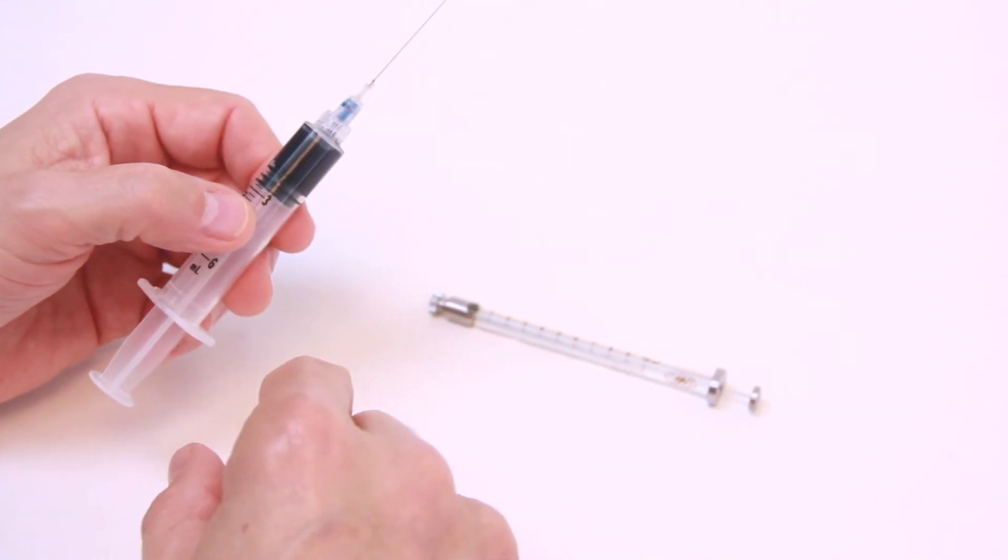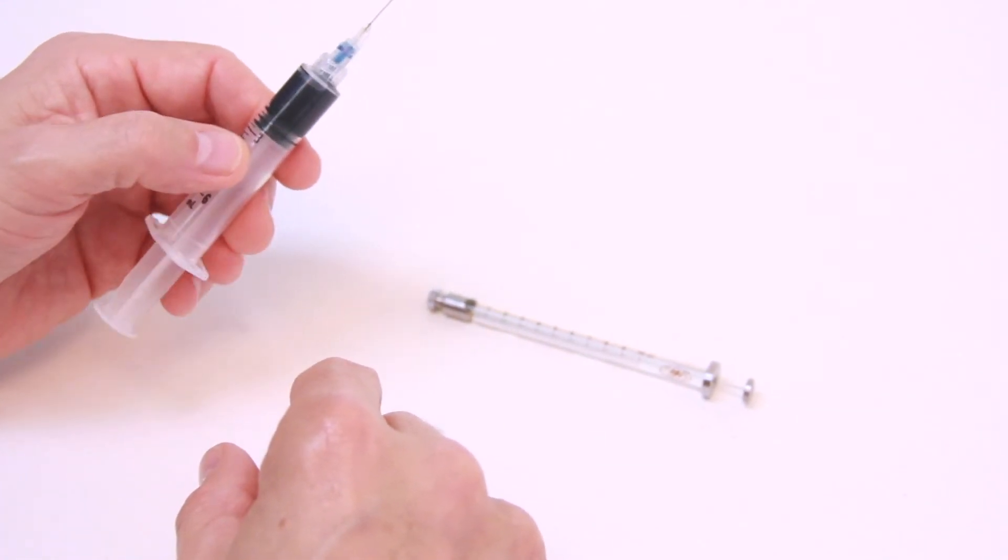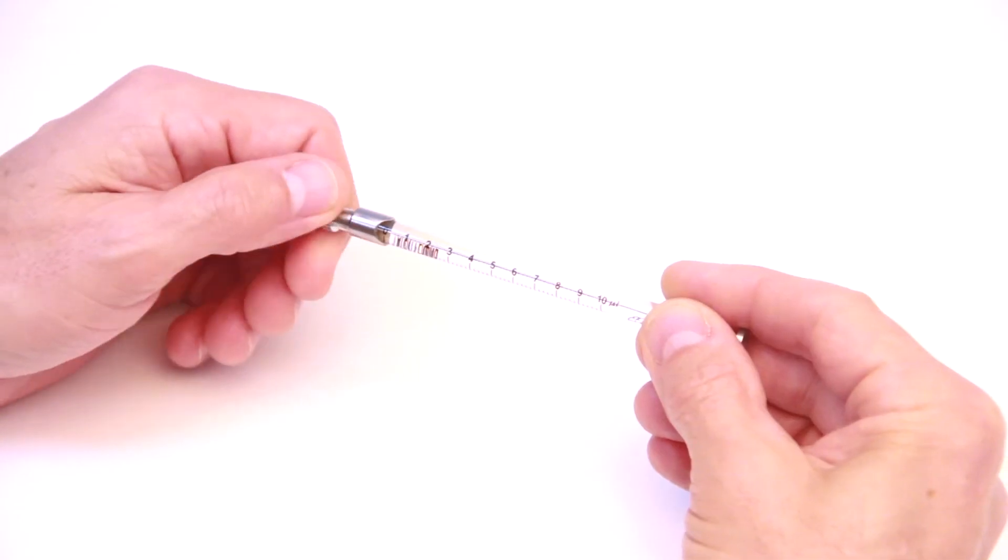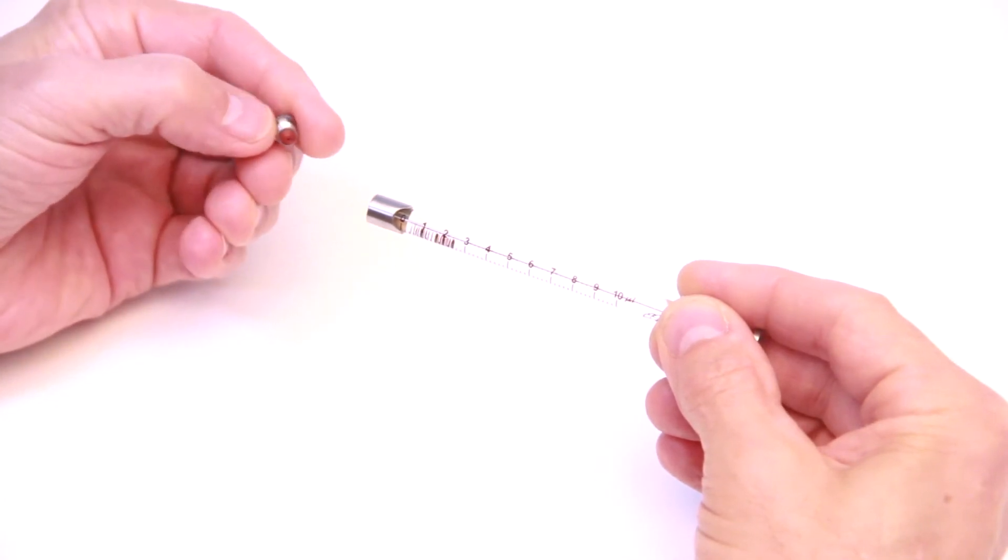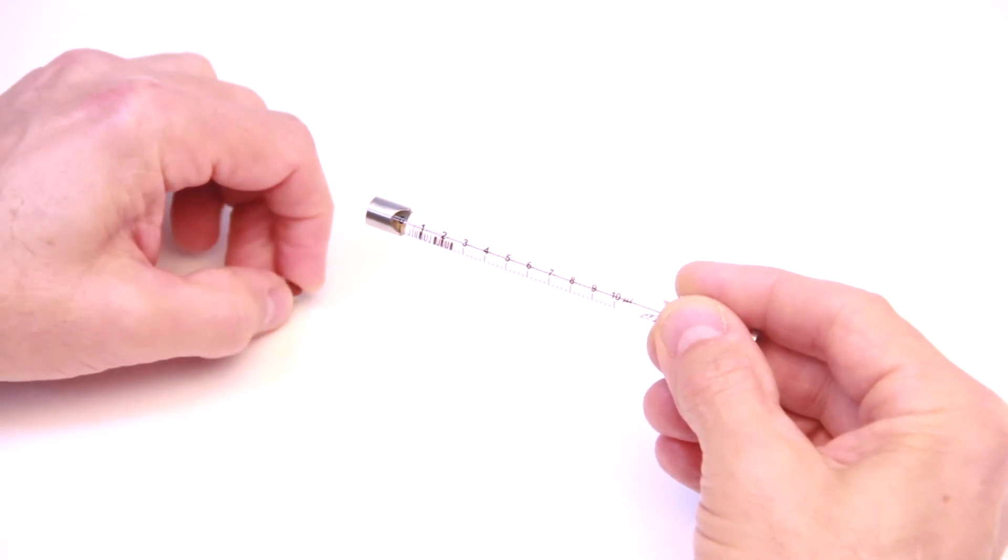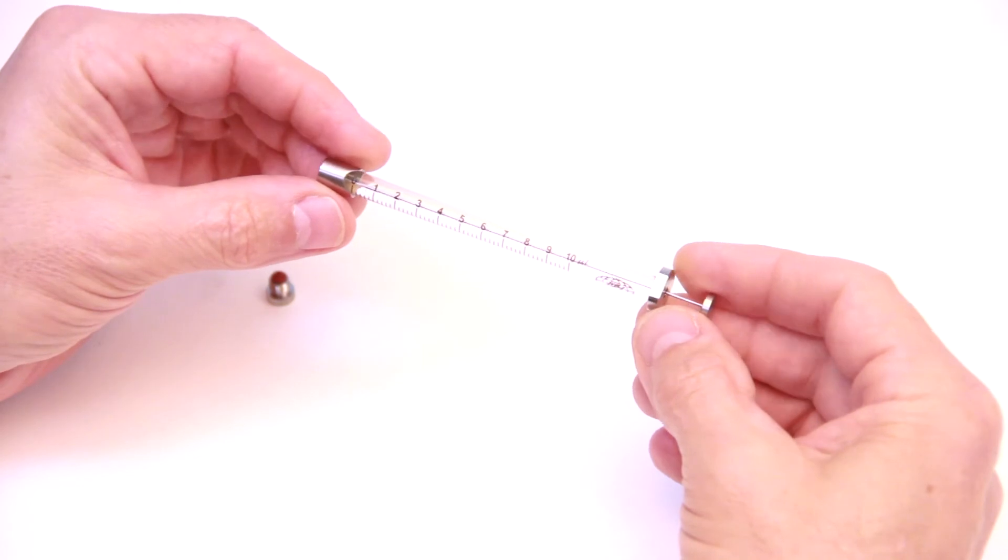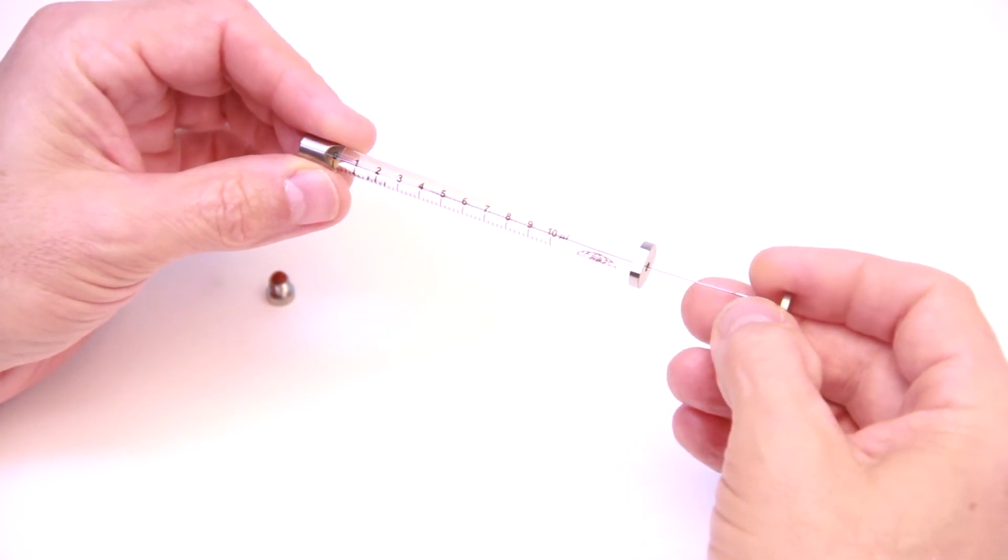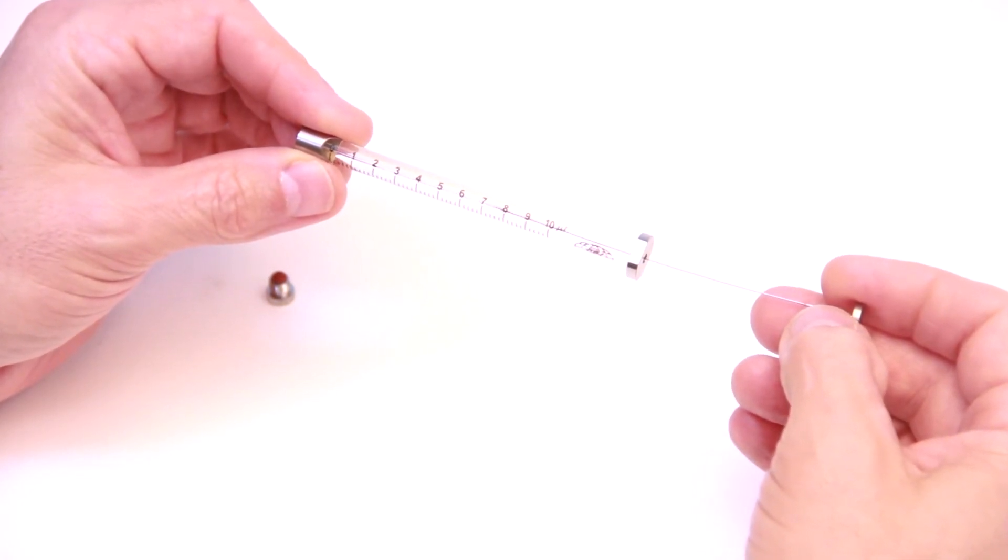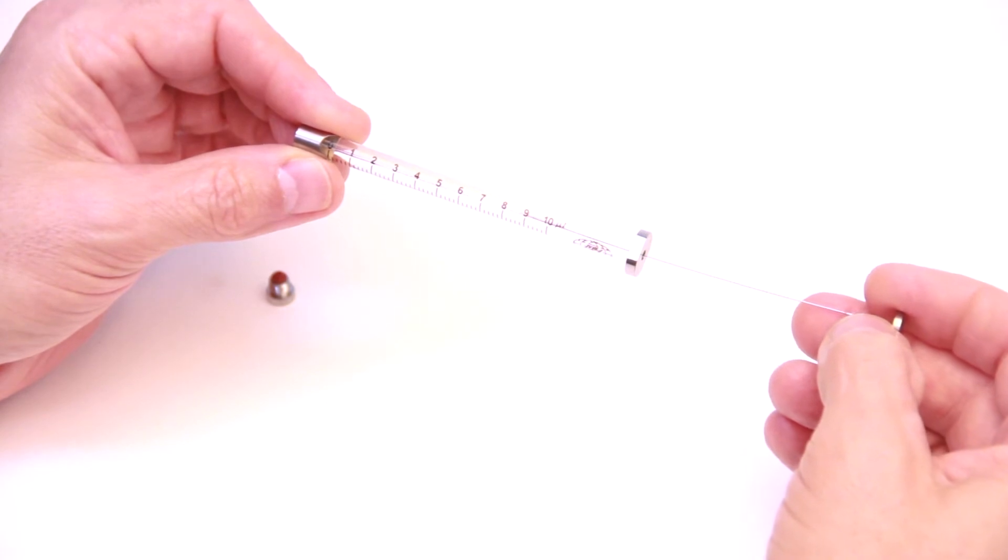So it's this simple: you just remove the locking cap from the NanoFil syringe along with the washer, pull back the plunger to the volume that you would like to use.